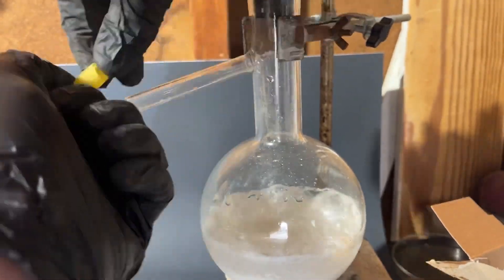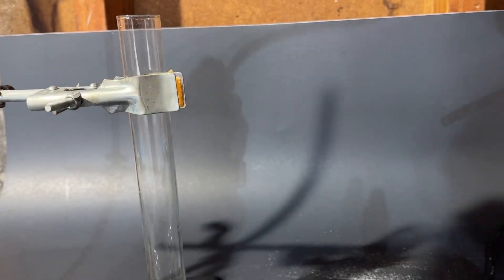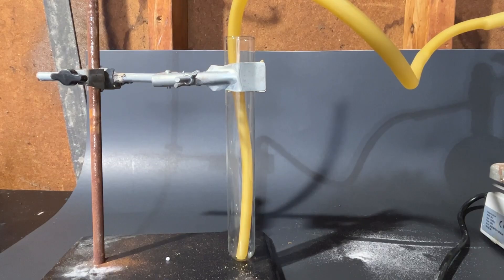This should boil out ammonium bicarbonate, which I can collect by attaching one end of a rubber tube to the flask, and the other end I put in a chilled test tube. And after about 30 minutes, literally nothing happened.